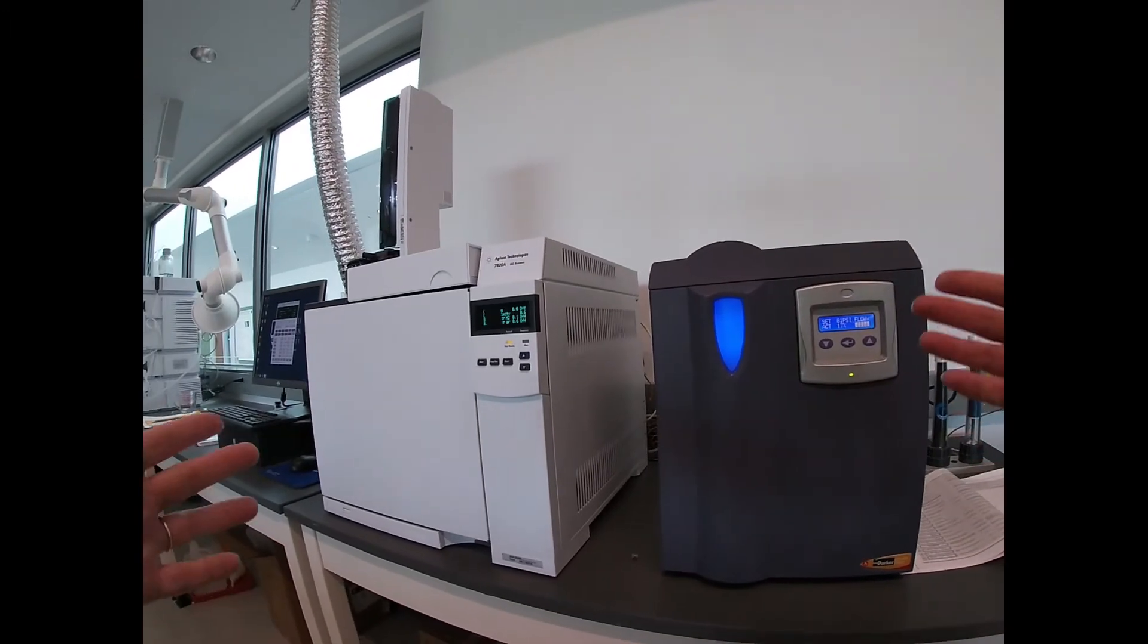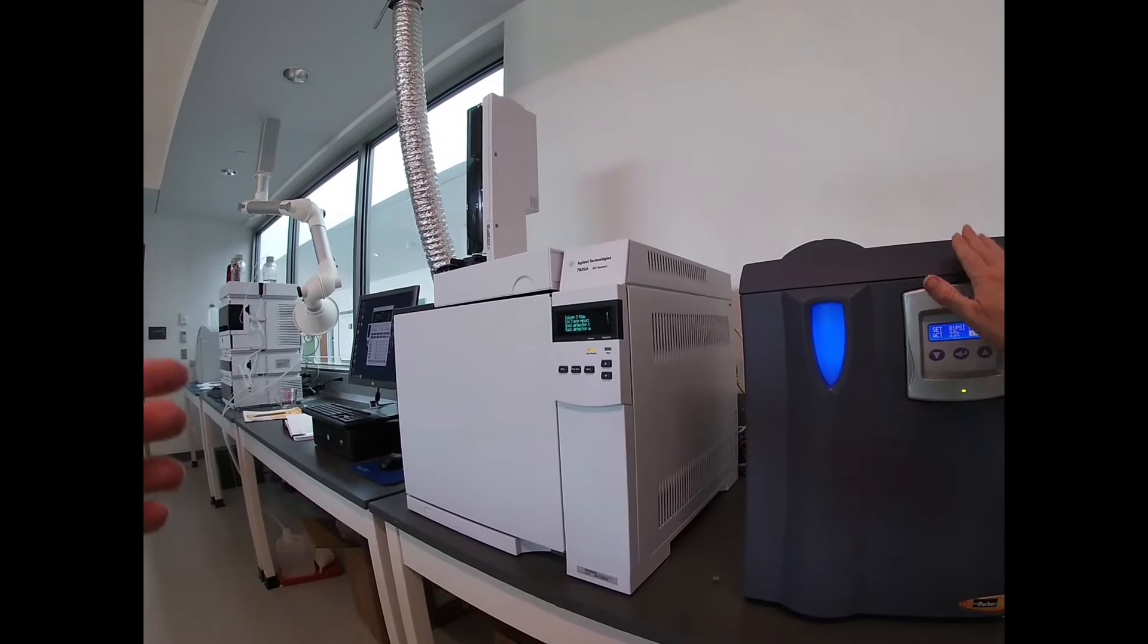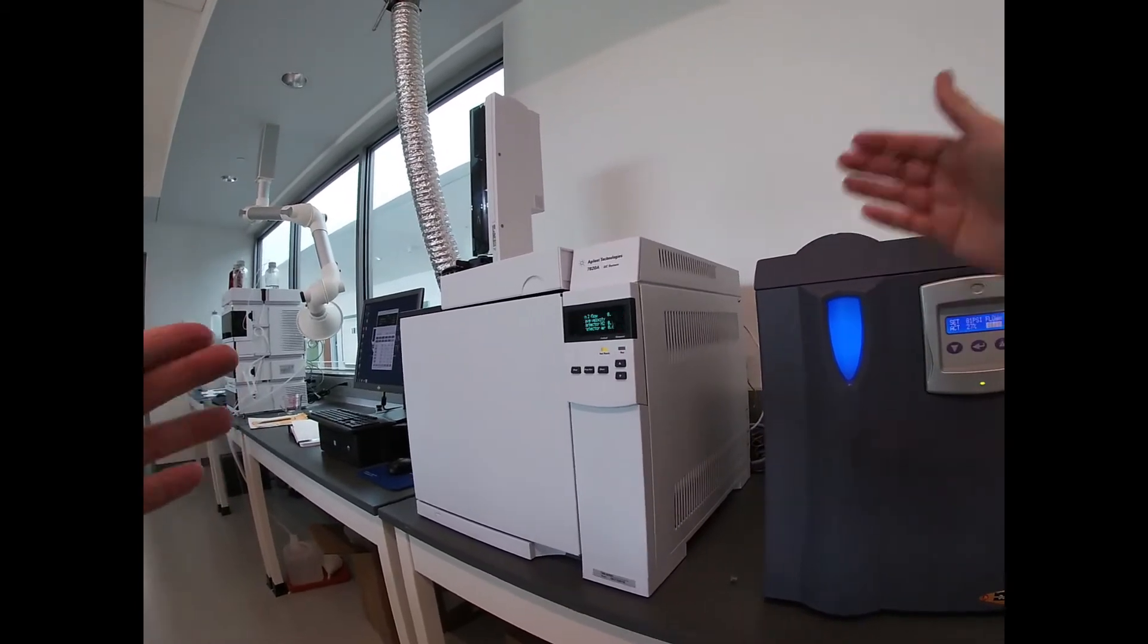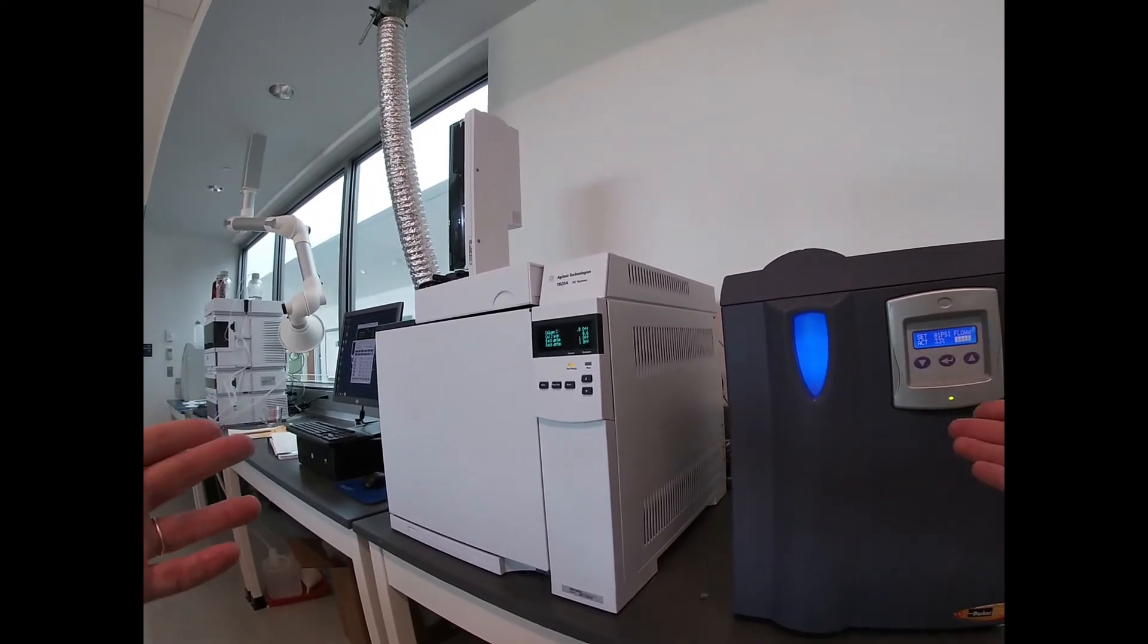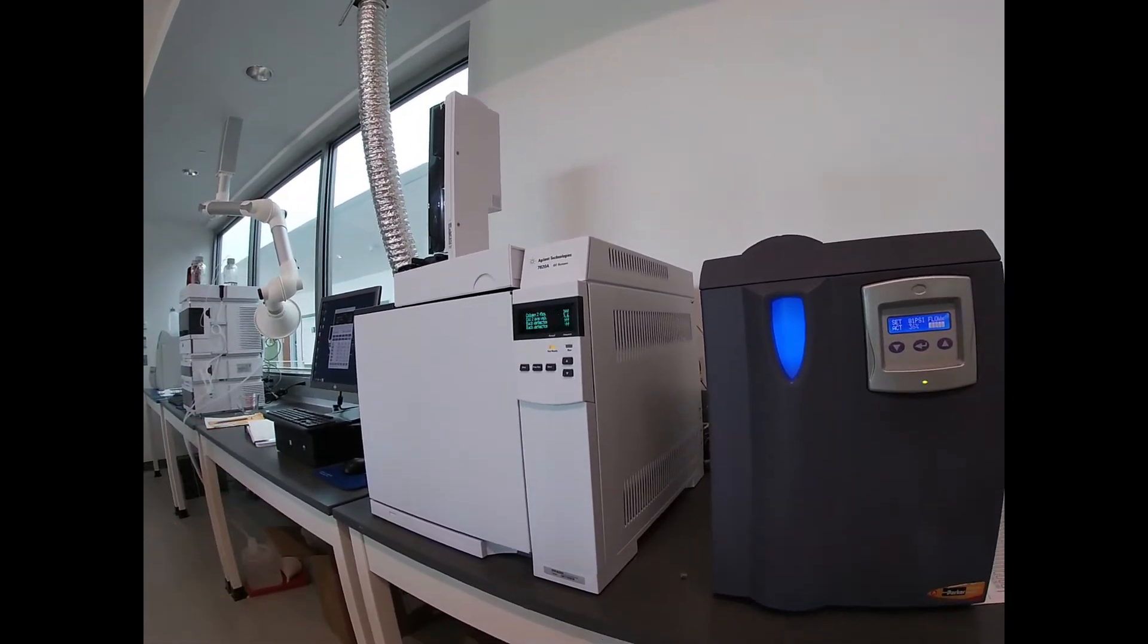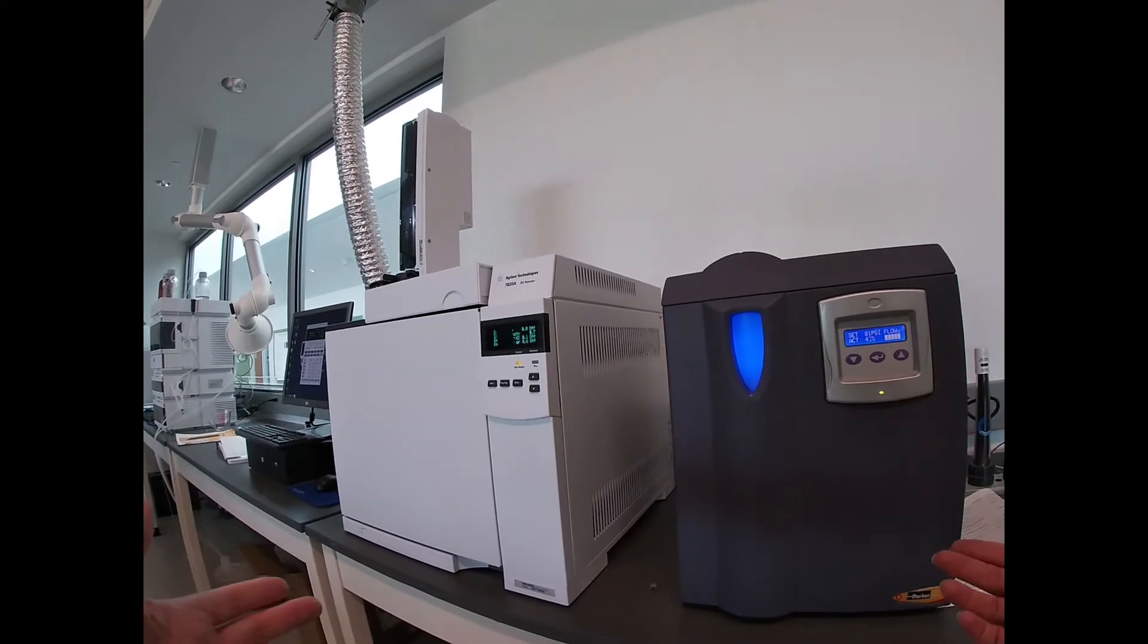Helium is becoming more and more expensive. So our hydrogen generator here not only is our mobile phase, but it is also the fuel because this has an FID detector, a flame ionization detector, which is fueled by hydrogen. So it makes a hydrogen flame. And so the hydrogen, again, is used for the fuel for our detector as well as our mobile phase.